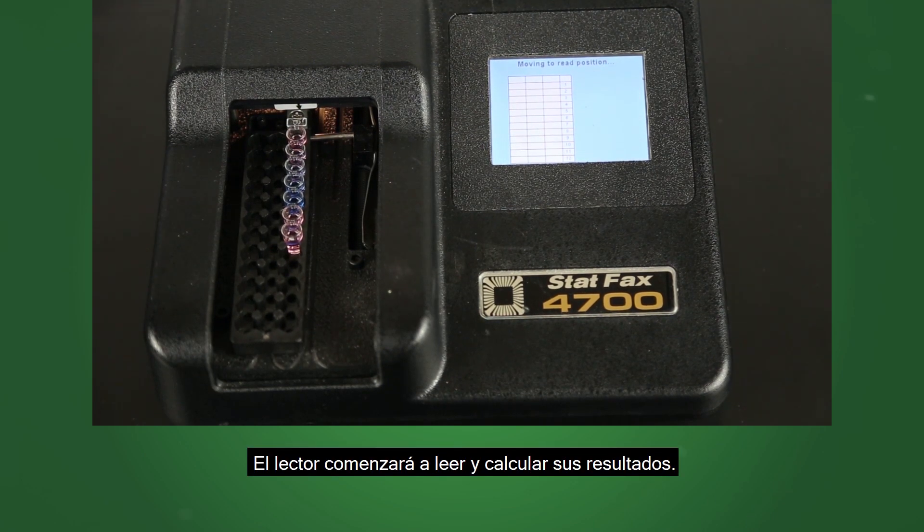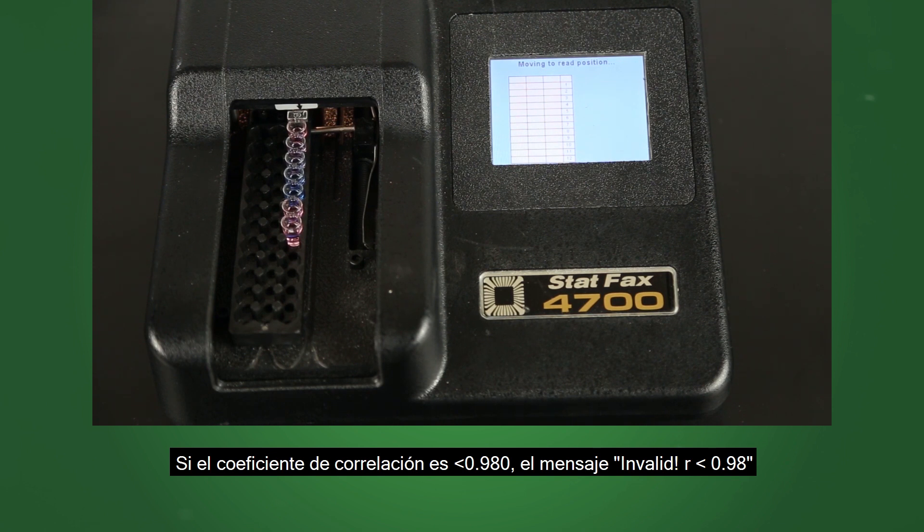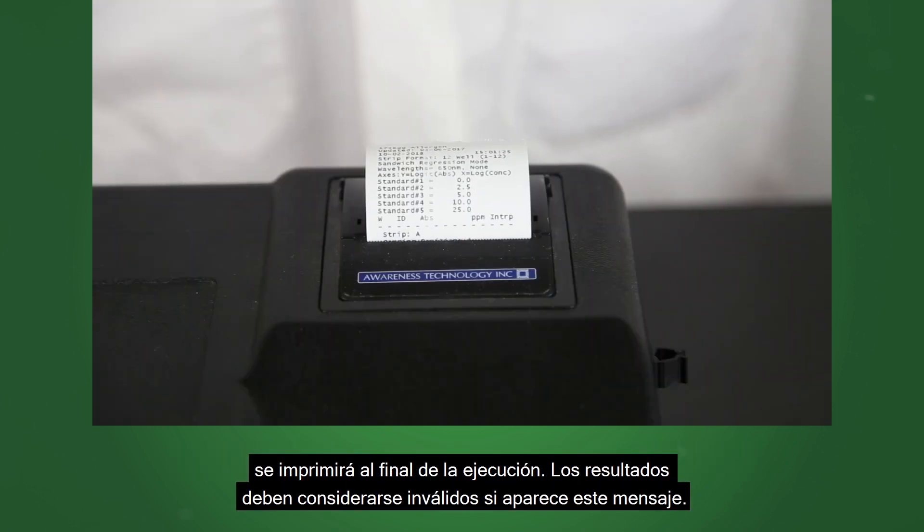The reader will begin reading and calculating your results. If the correlation coefficient is less than 0.98, the message 'invalid, R less than 0.98' will be printed at the end of the run. Results should be considered invalid if this message appears.